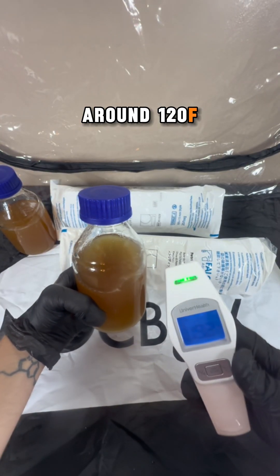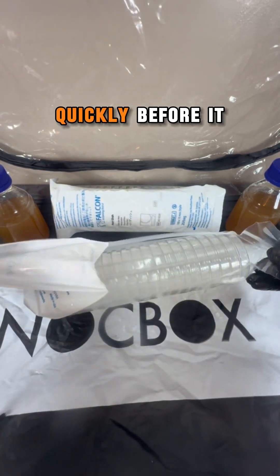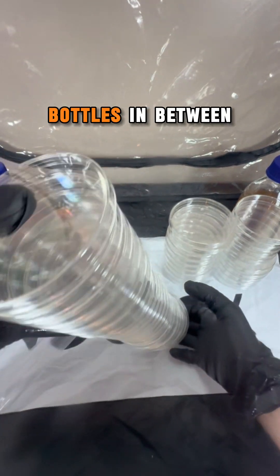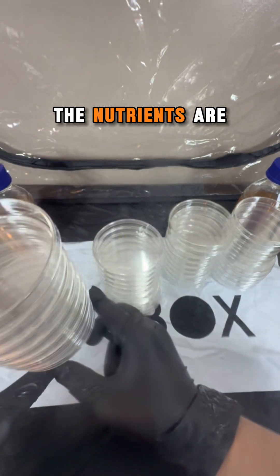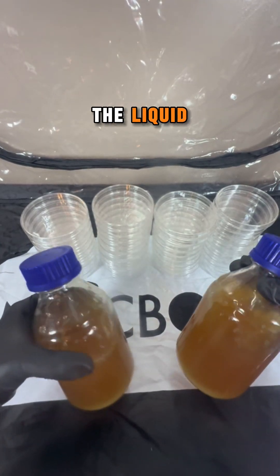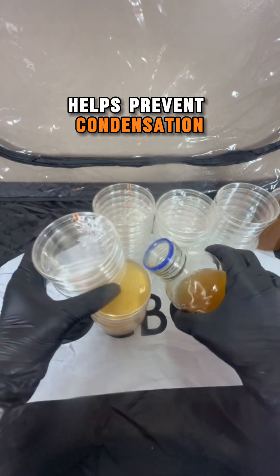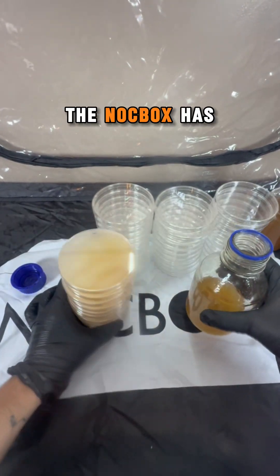I check the temperature of the agar solution and once it's around 120 degrees Fahrenheit, I start to pour the plates quickly before it solidifies. I pour the plates in stacks of 10 and twirl the bottles in between stacks to make sure the nutrients are distributed evenly in the liquid. Pouring at a temperature right before solidification helps prevent condensation in the petri dishes.